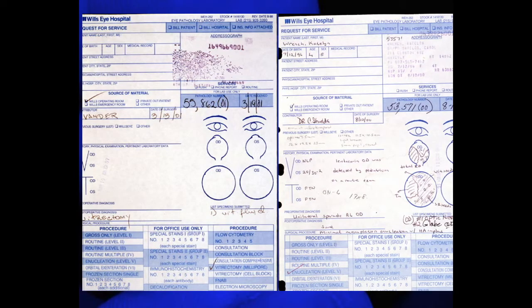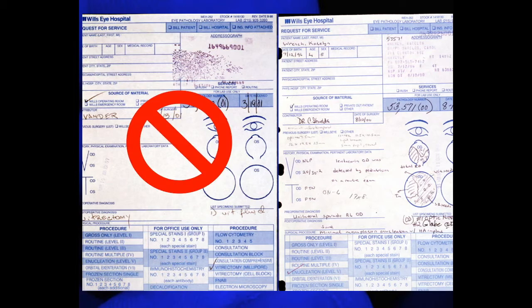The poorly completed path slip on the left provides no information. The slip on the right provides lots of information and gets a gold star. If the pathologist receives adequate clinical information, he or she may not have to do expensive, unnecessary tests.